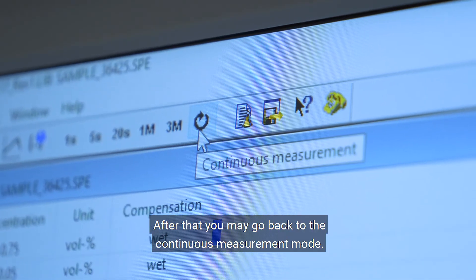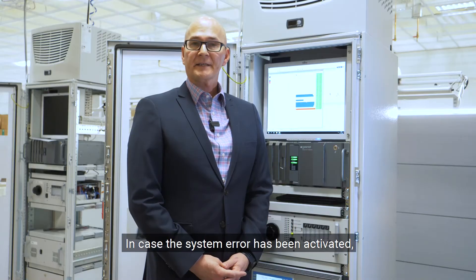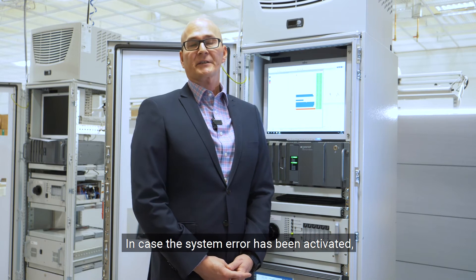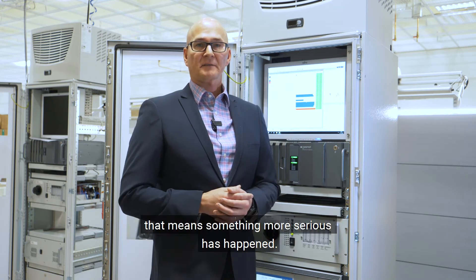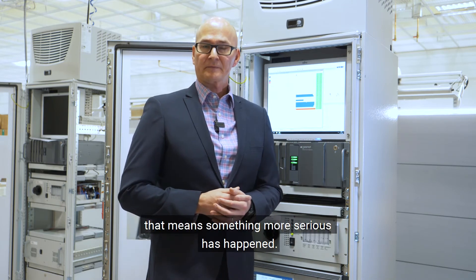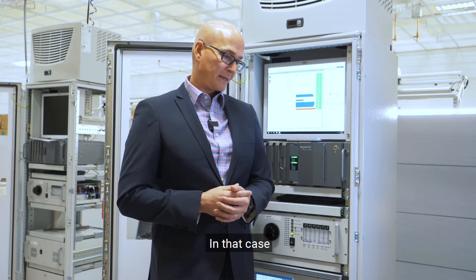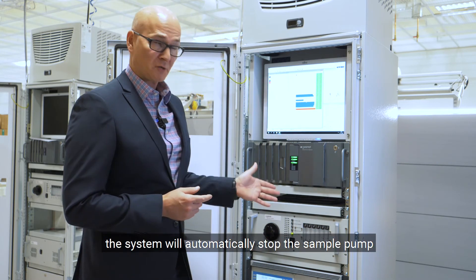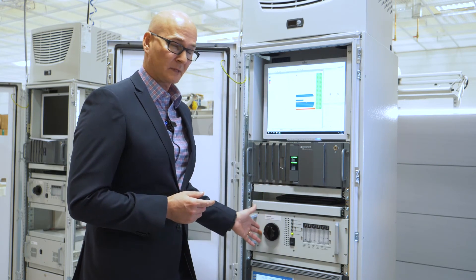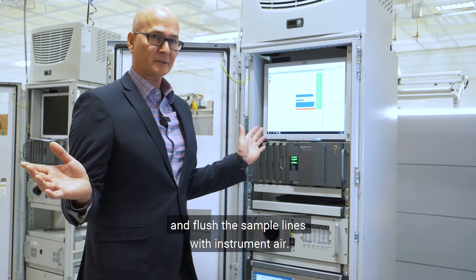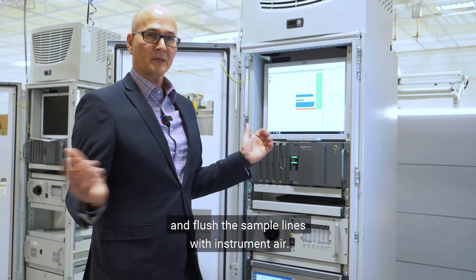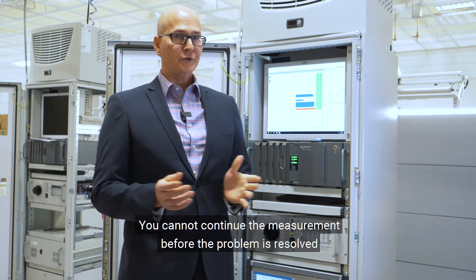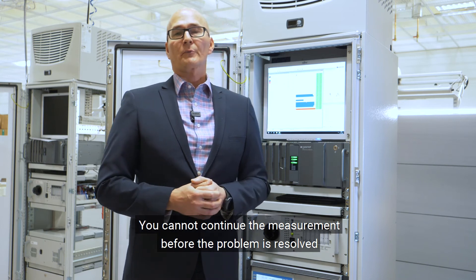In case the system error has been activated, that means something more serious has happened. In that case, the system will automatically stop the sample pump and flush the sample lines with instrument air. You cannot continue the measurement before the problem is resolved.